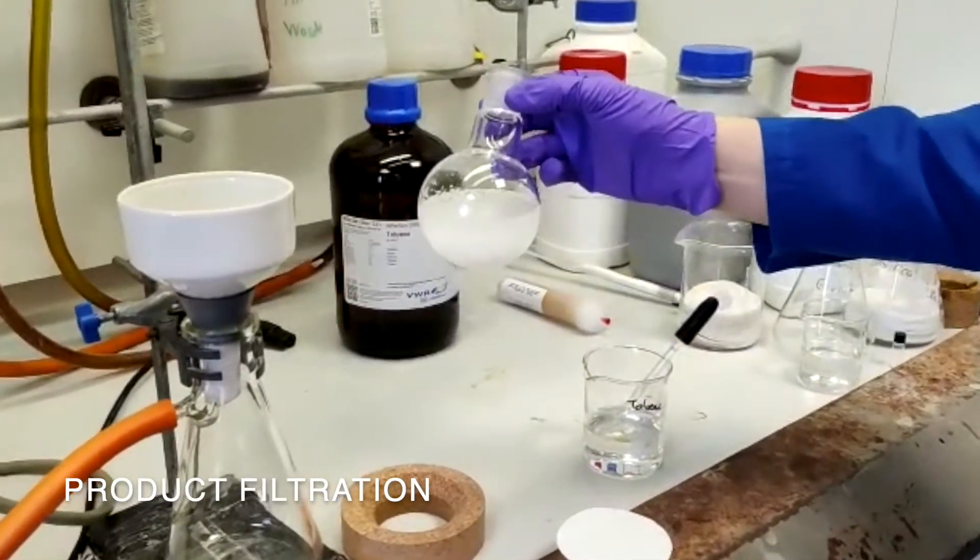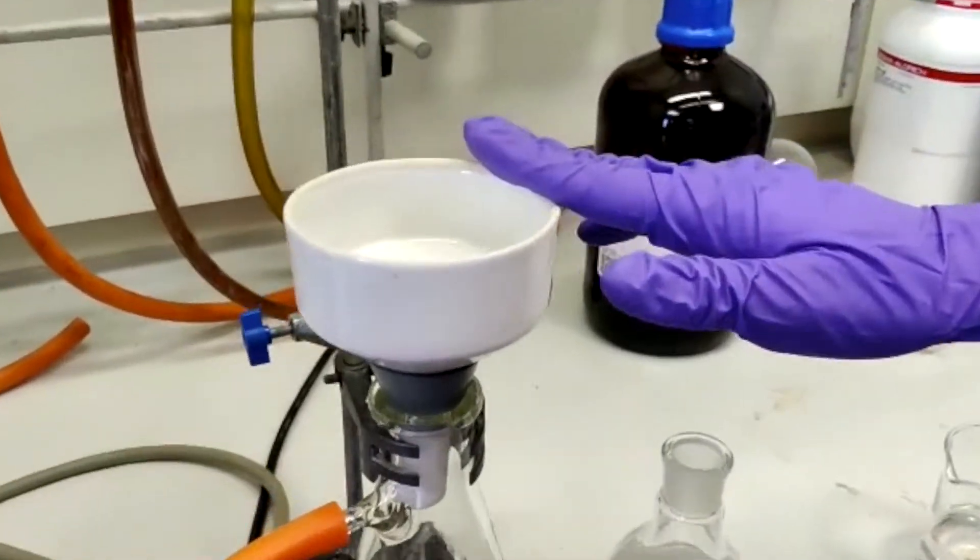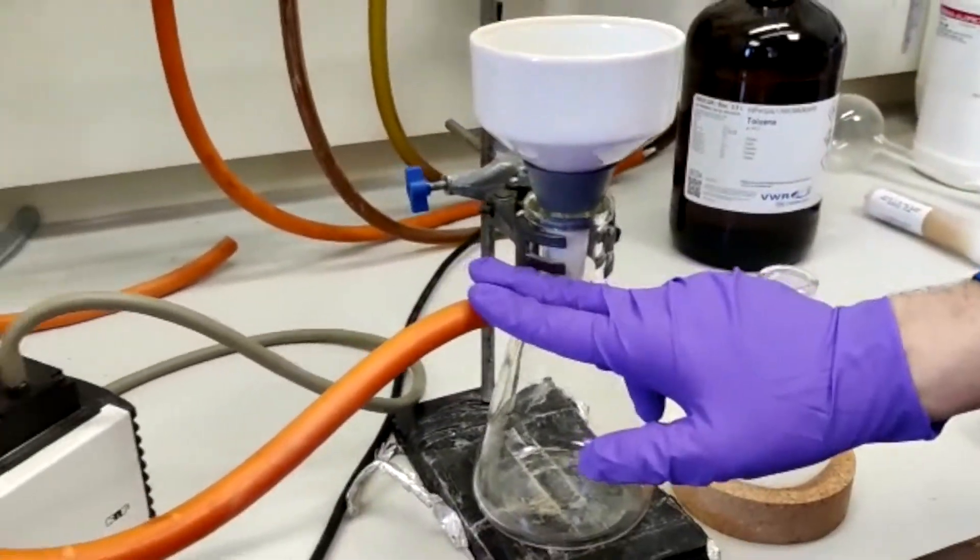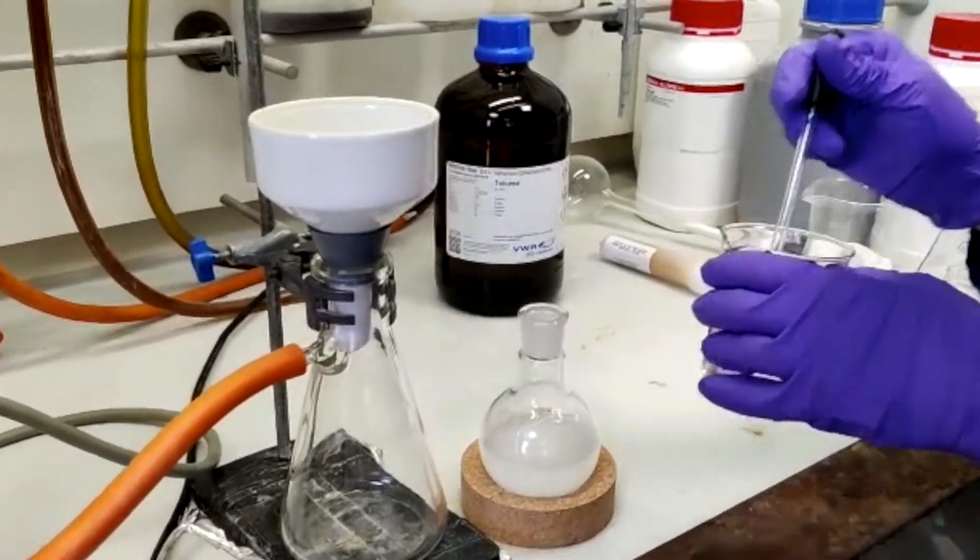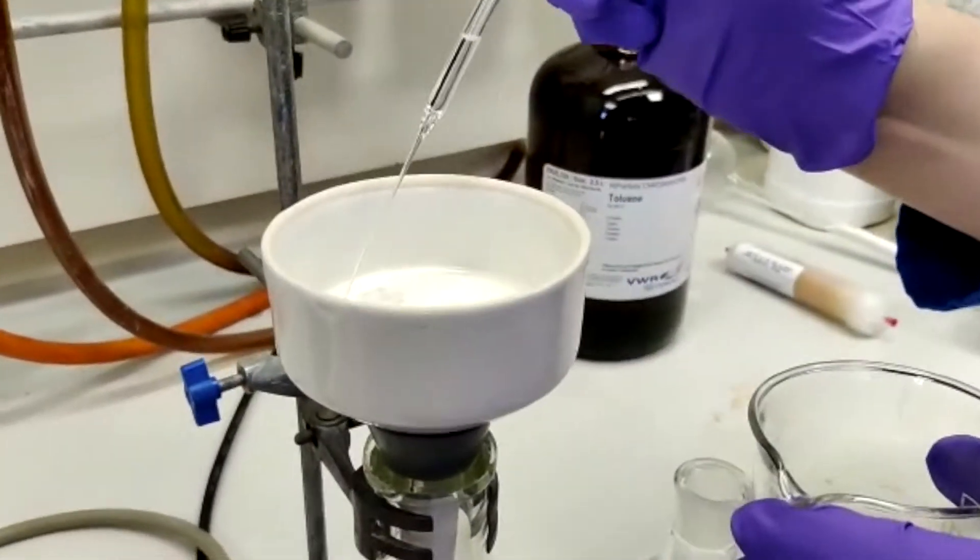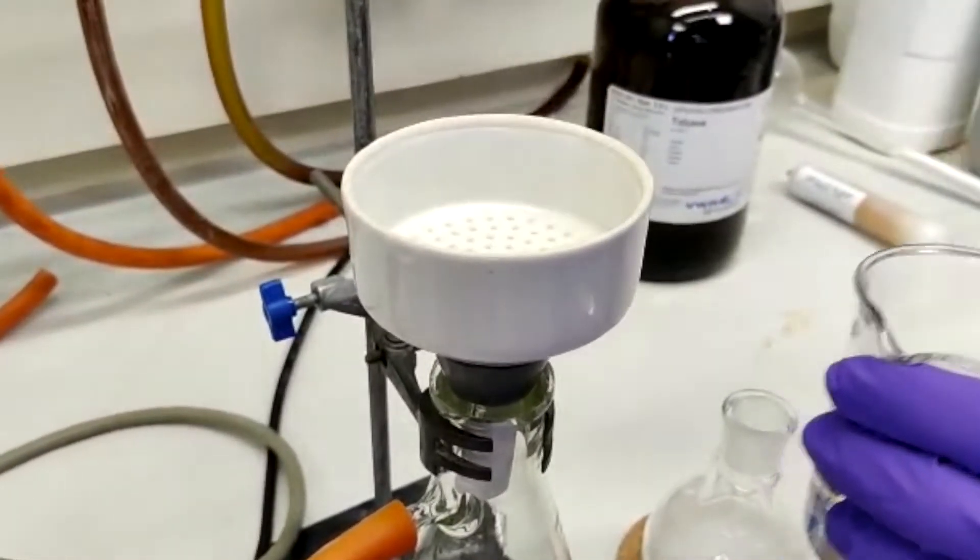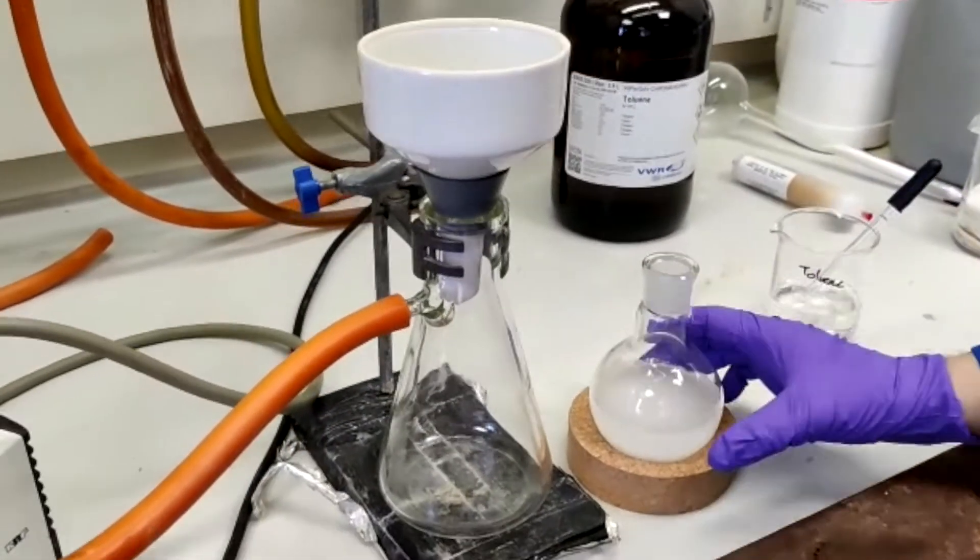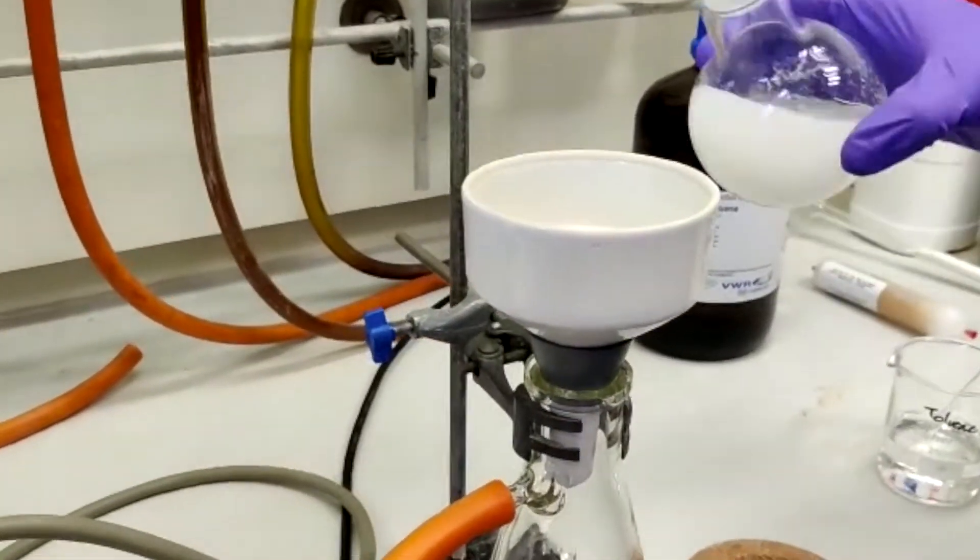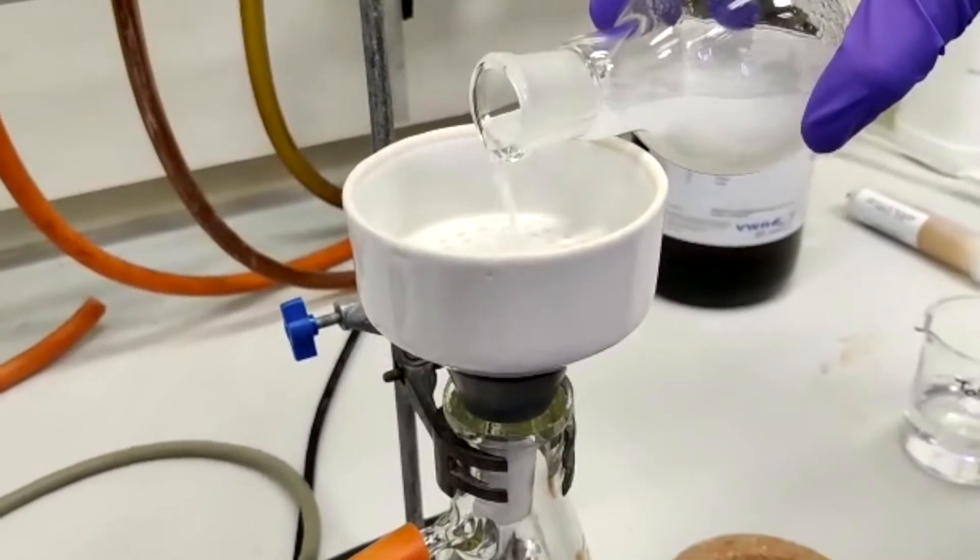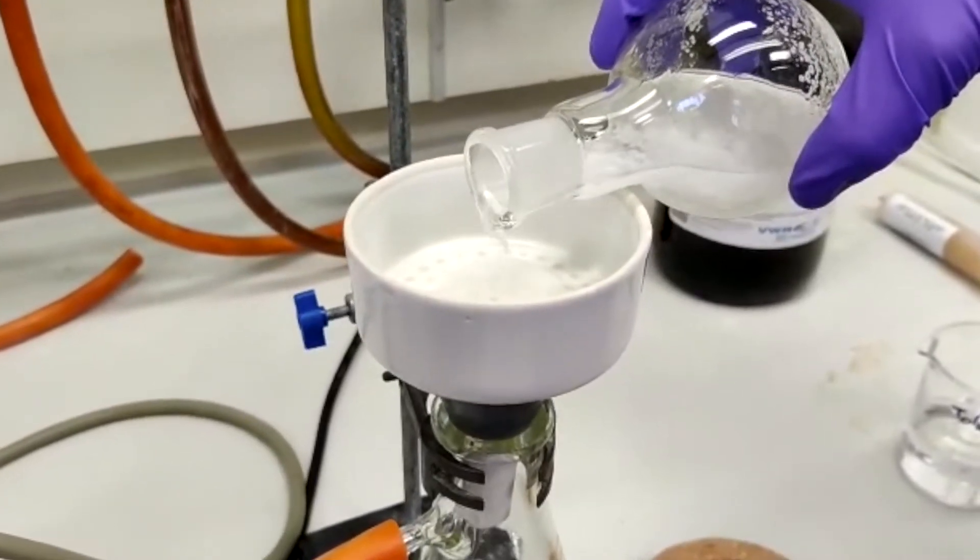So we've removed the stir bar from our product and we're now going to filter this recrystallized product. You'll need a filter paper, which you place inside a Buchner funnel, which is attached to a Buchner flask and a vacuum system. We're also going to need some toluene to wet our filter paper and rinse our product. What you want to do is lightly wet the filter paper on your Buchner funnel. We use toluene as our product is not soluble in toluene. We'll then briefly switch on our vacuum. Give the product a swirl. You gently pour your product into the center of the filter paper, making sure not to disturb it.